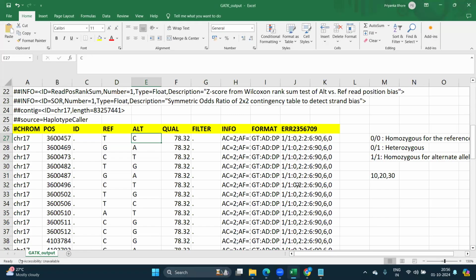So what we have done till now is we have run the pipeline. We have got the VCF file. For this VCF file, today we have seen the description of what this VCF file actually is, and what kind of information it is storing. Then we retrieved the extra information about this VCF file from the VEP tool. Today I told you how to use the VEP, Ensembl VEP. That's it. Okay. So that's it from my side for today.